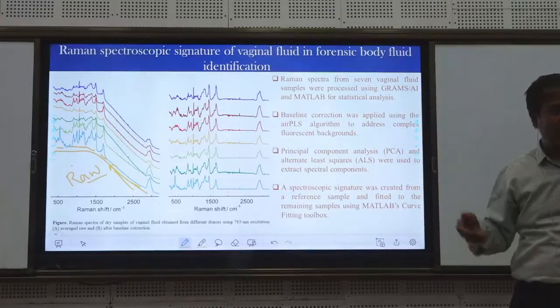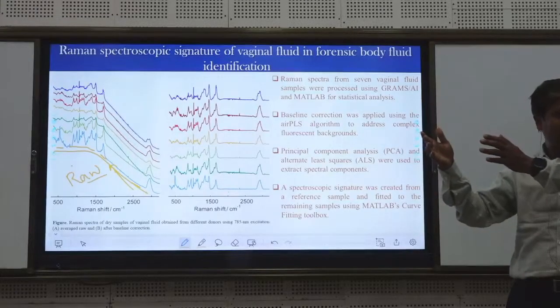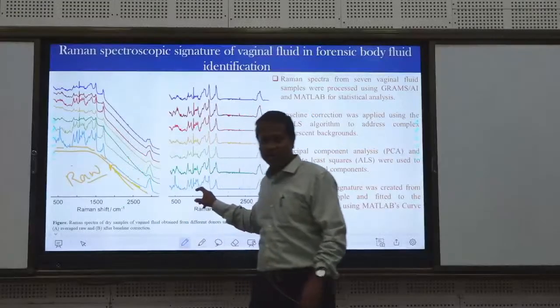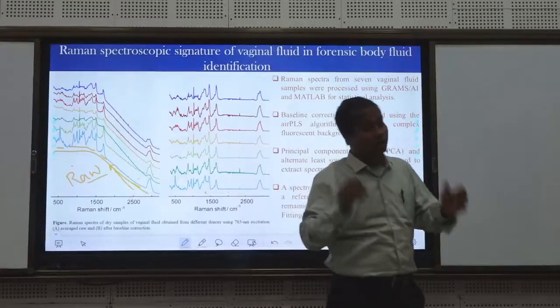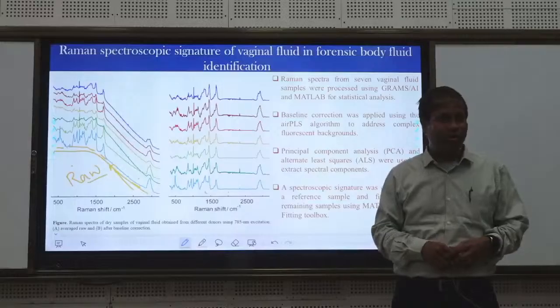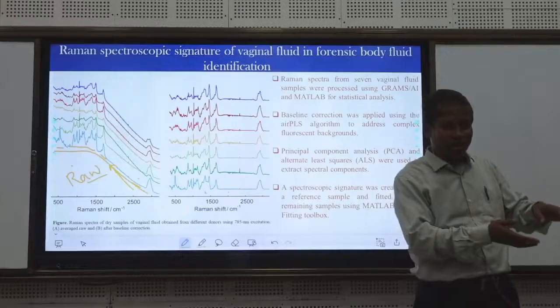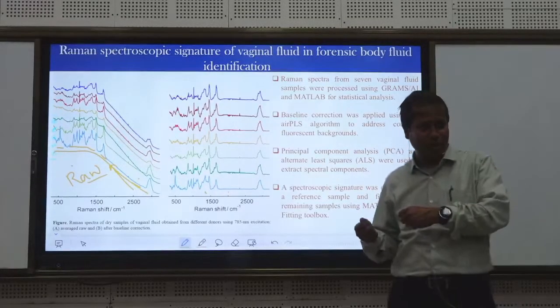So where does this program come from? The instrument manufacturer purchases that software from them, from an algorithm. This is called an algorithm. So they write a program, and if you run that program on this spectrum, then you get a clear, acceptable spectrum. So there are some groups who are doing this. Now imagine if those kinds of groups did not do it, then you would not get a good spectrum. But we never think of contributing in that line. One should think of contributing in fundamentals, even if it is not prominent.